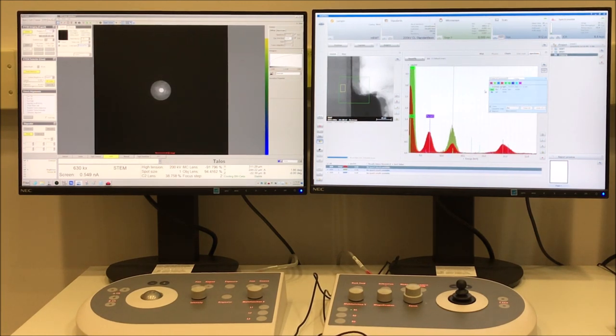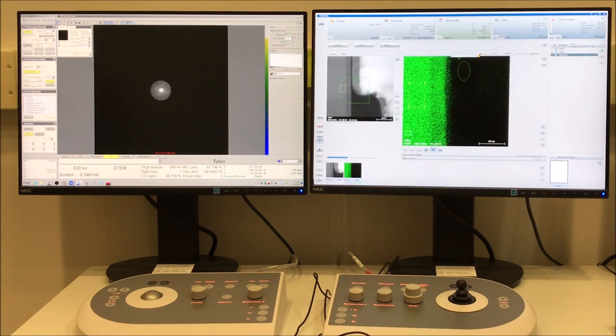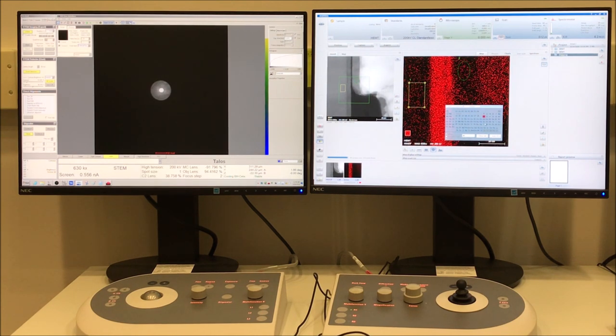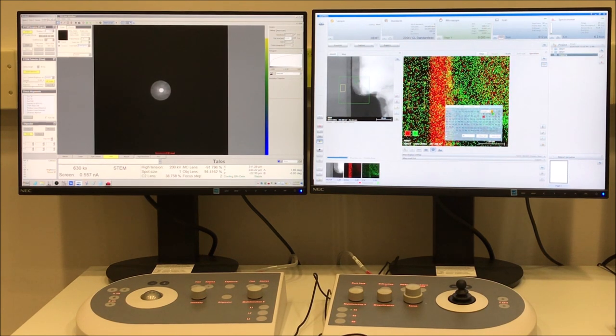So I'm going to go ahead and do this manually. Just go back to select map there and select the little periodic table. Right now we only have one element. And then we can just go to the table of elements. Just clear everything, and then you can manually add in the elements that you want. Again, unfortunately, you're probably going to have to then go back and reset the colors that you had before.